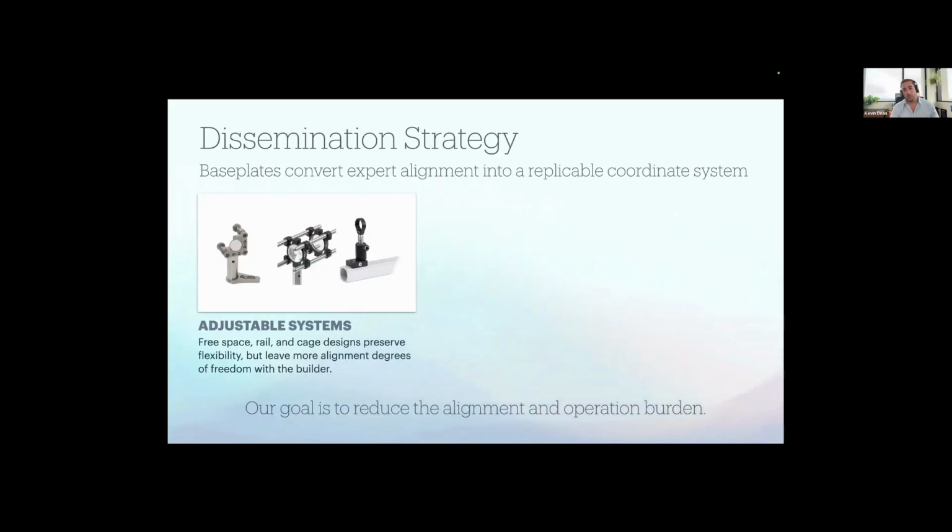And so this audience is probably pretty familiar with the joys of aligning optics by hand. It can be very zen. It can also be very frustrating. So the vast majority of systems that we first started out building really used these free space optical systems where you literally placed and shimmed every single optical element on the table, measuring back reflections or focus position or collimation, and doing this step by step until you got to the very end, and it could take a long time.